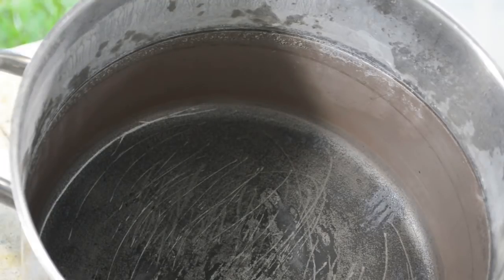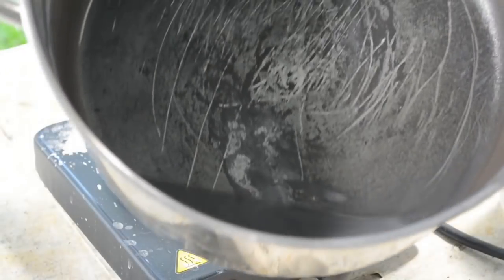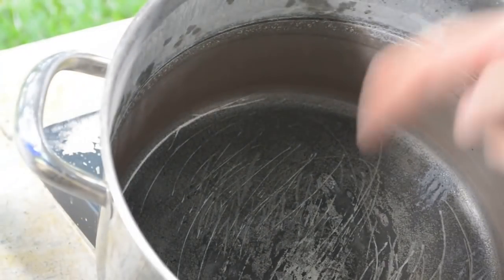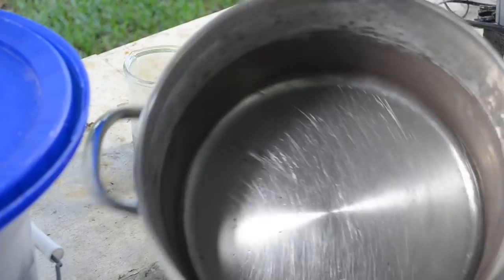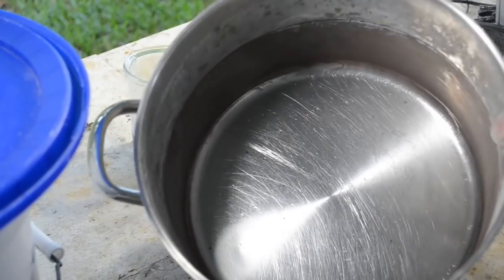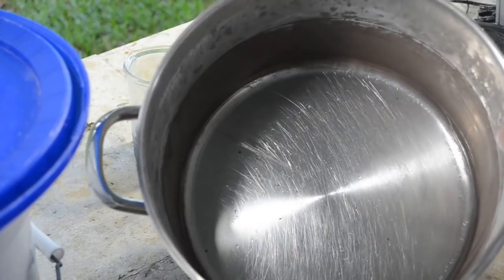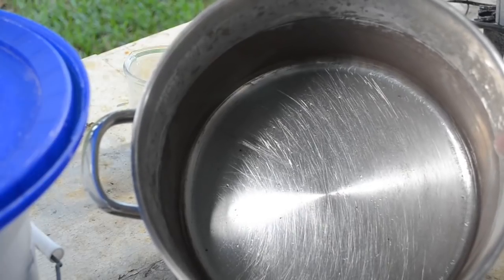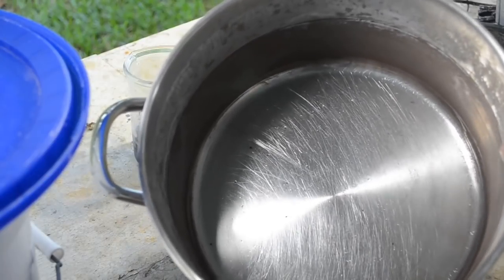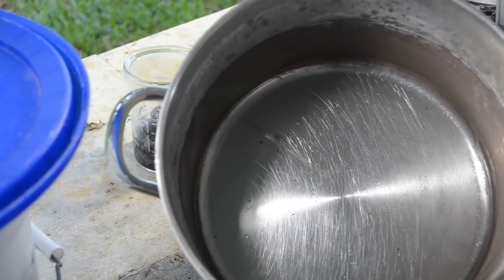So anyway, I'm going to have to get the rest of this little bit of liquid down in the bottom of this thing into the Buchner funnel and then scrub out the gold in there before I dump the clean liquid back in so we can do a second cementation. Okay, I got the bottom of the pot clean, got all the cement gold and zinc that was stuck on it off. And I've had this problem before with the zinc and cement gold sticking hard to the bottom of whatever vessel I'm using. It doesn't really matter if it's stainless steel, plastic, or a glass beaker. It will stick hard to the bottom.